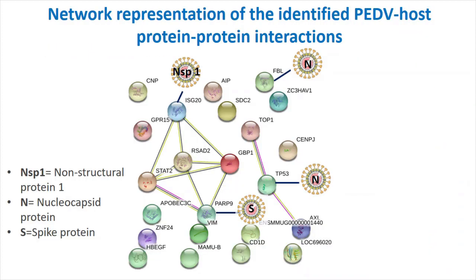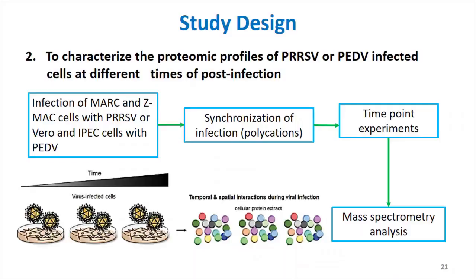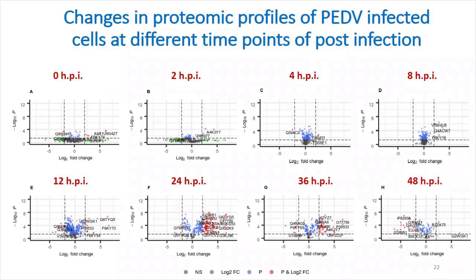And like I said, I really believe that these host proteins play an important role in viral pathogenicity. Some of them, of course, are encapsulated randomly because they are just part of the cytoplasm. But I'm pretty sure that a few, maybe many of them, are there because they should be there. They are specifically encapsulated. So we made this list, and just briefly, for the cellular part of the work, we did a proteomic study of changes along the viral infection.